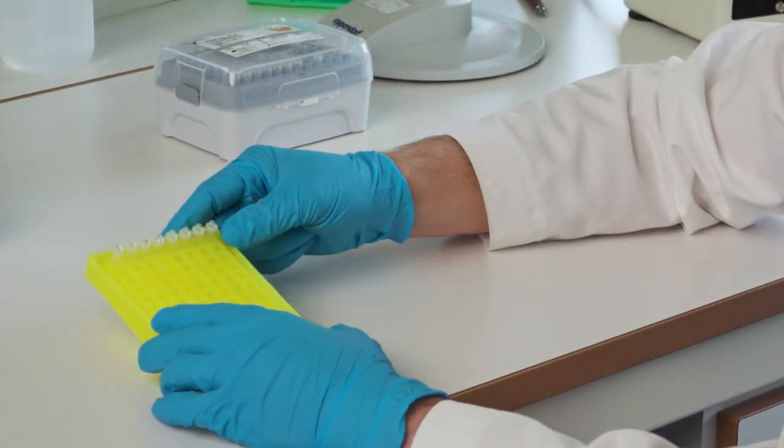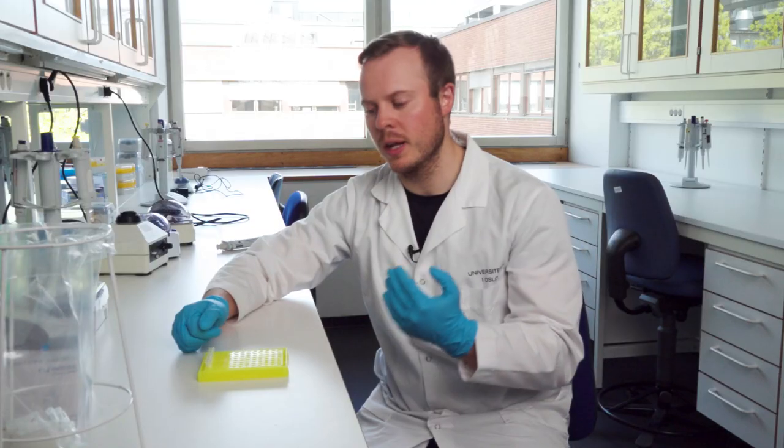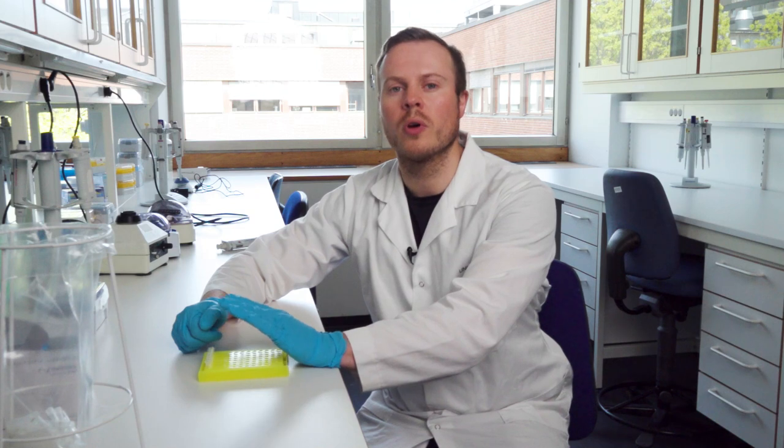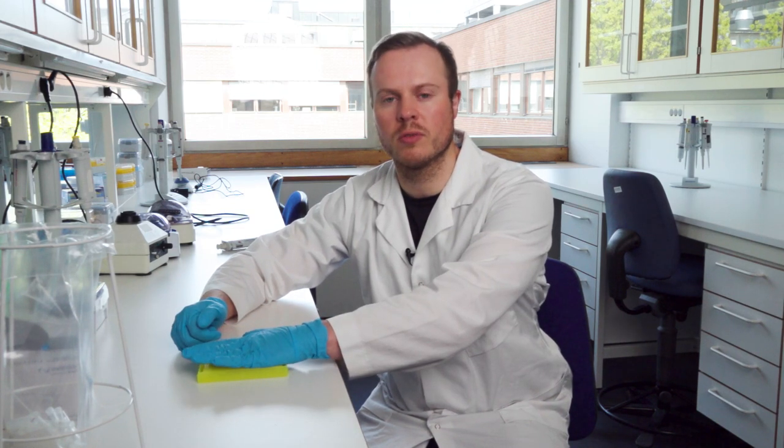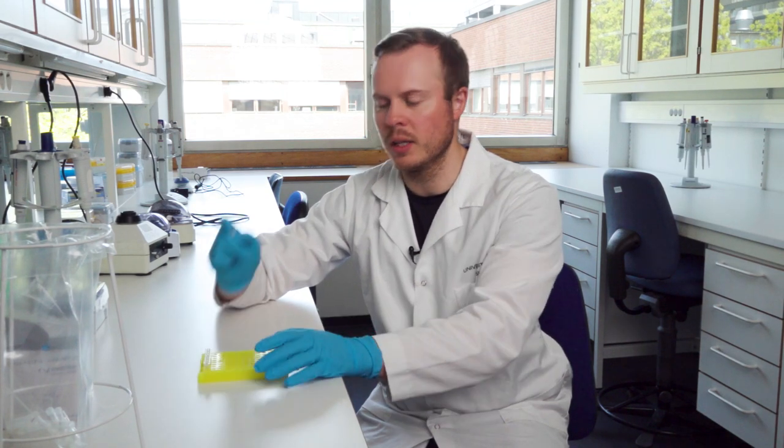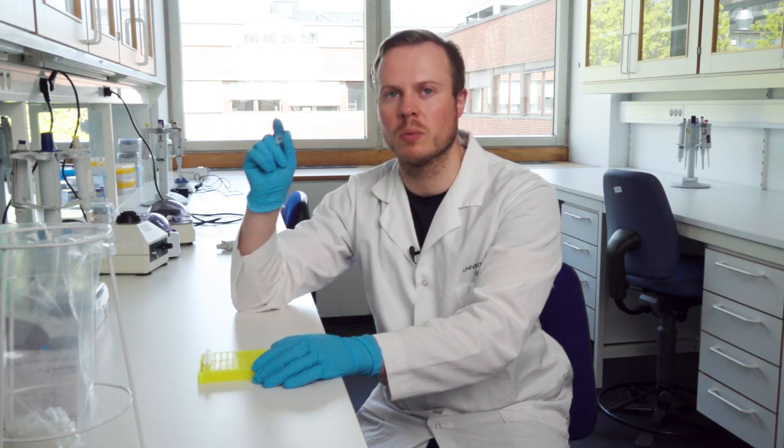And that is why the quantification is so important, because here we get the answer to how big is the concentration in each of these tubes that we need to do the calculations for the equimolar concentration in the final pool that we send into sequencing.